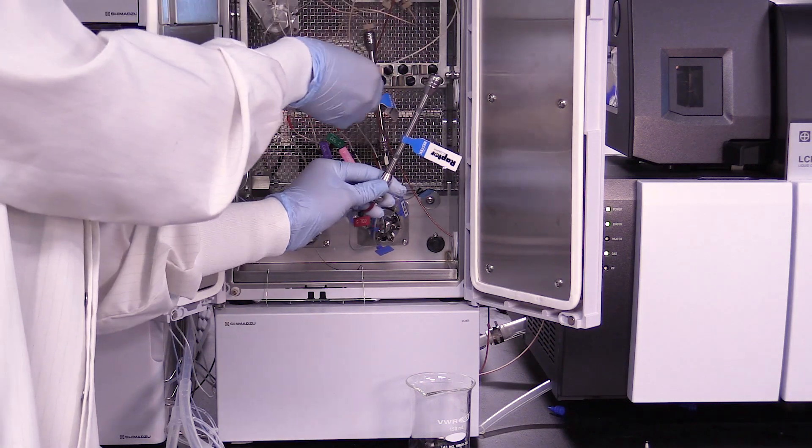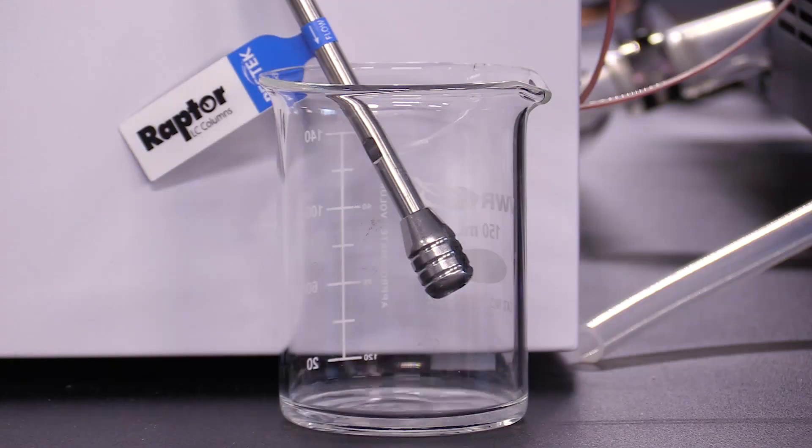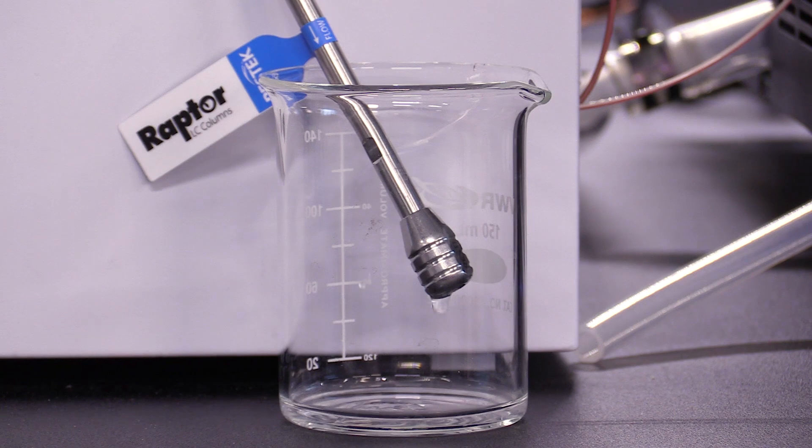Lastly, column fouling due to the buildup of particulates from the sample matrix can cause changes in retention times and increase back pressure. Column flushing or simply changing the column can solve the problem. Check with the column manufacturer to find suitable wash solvent for your column.